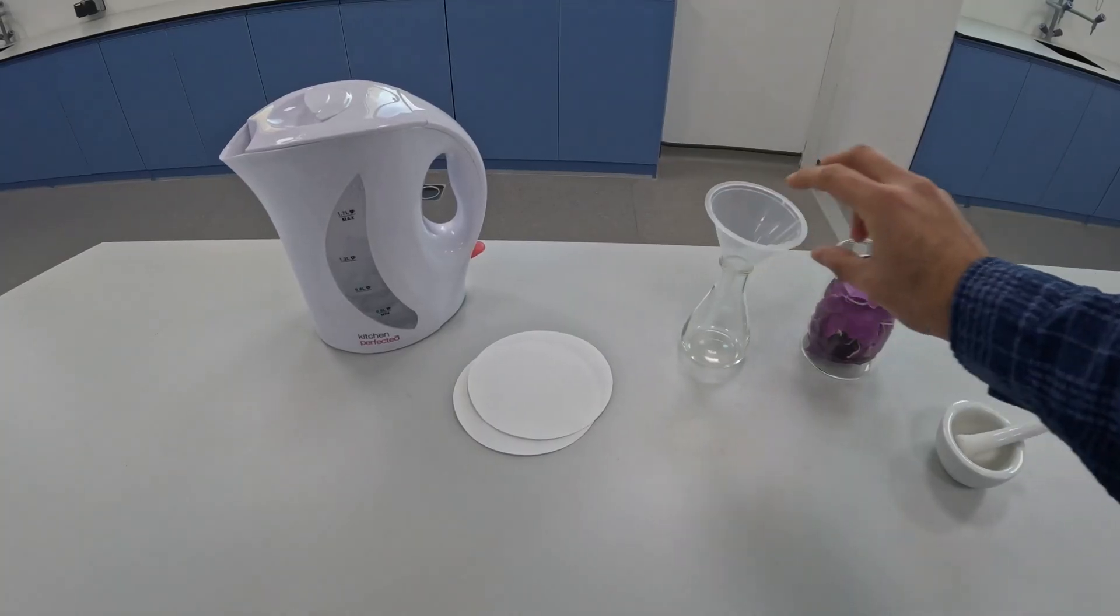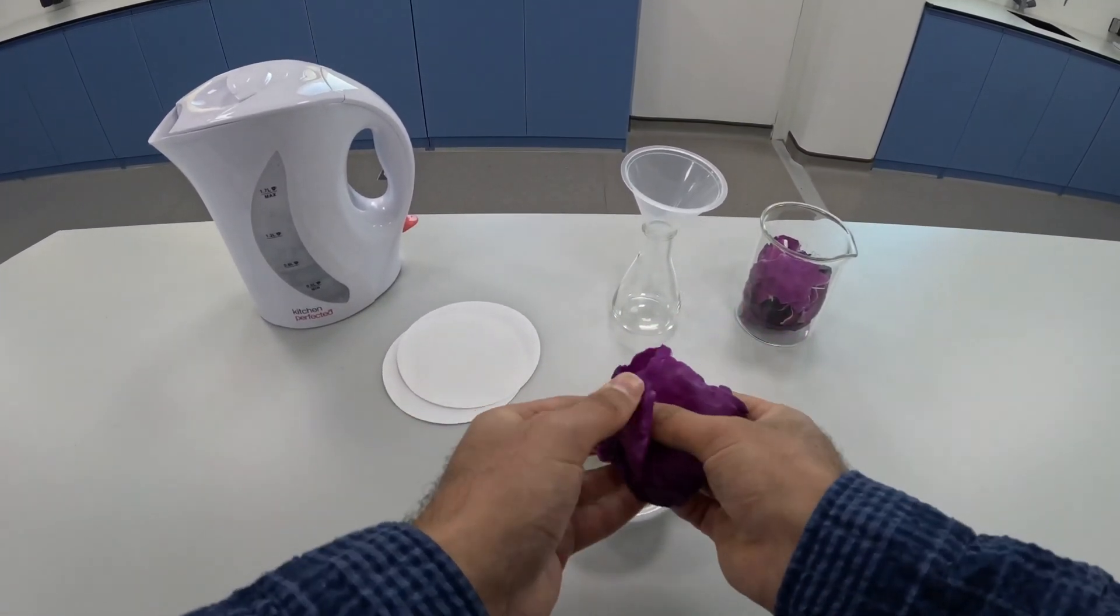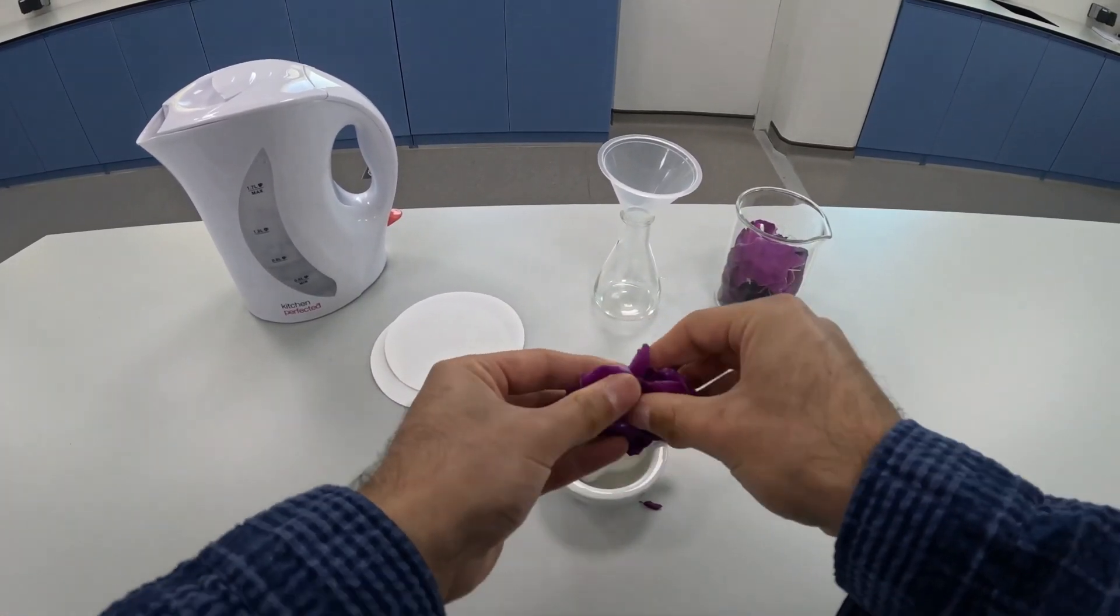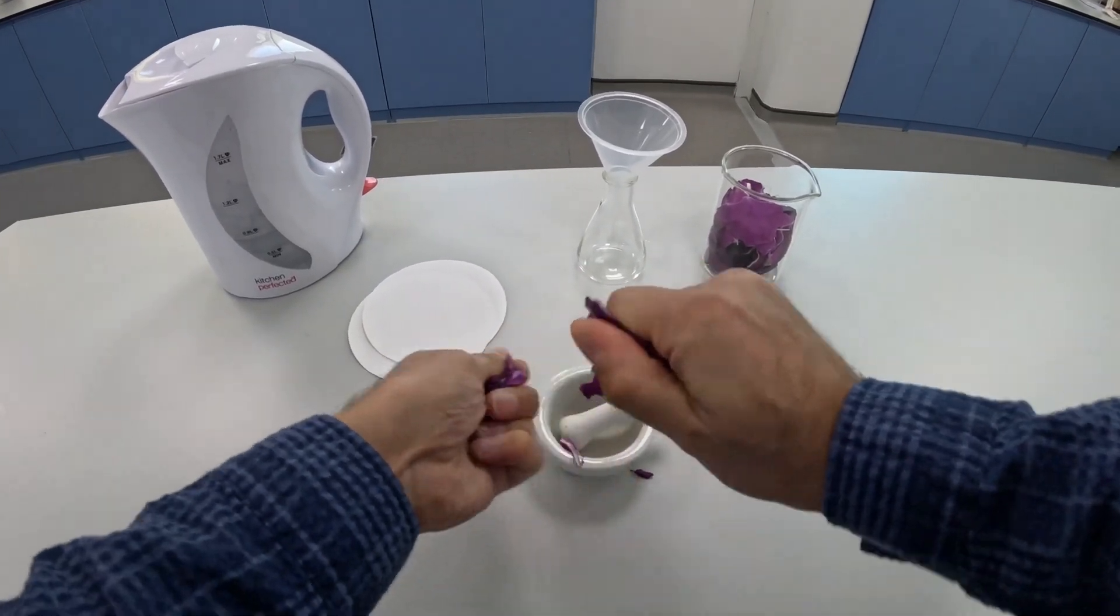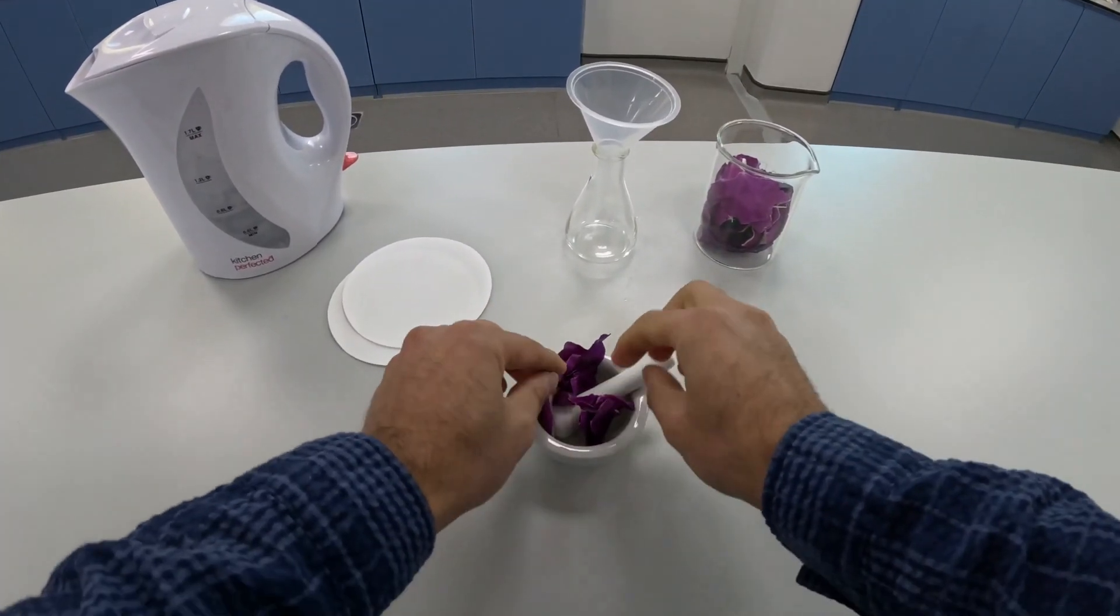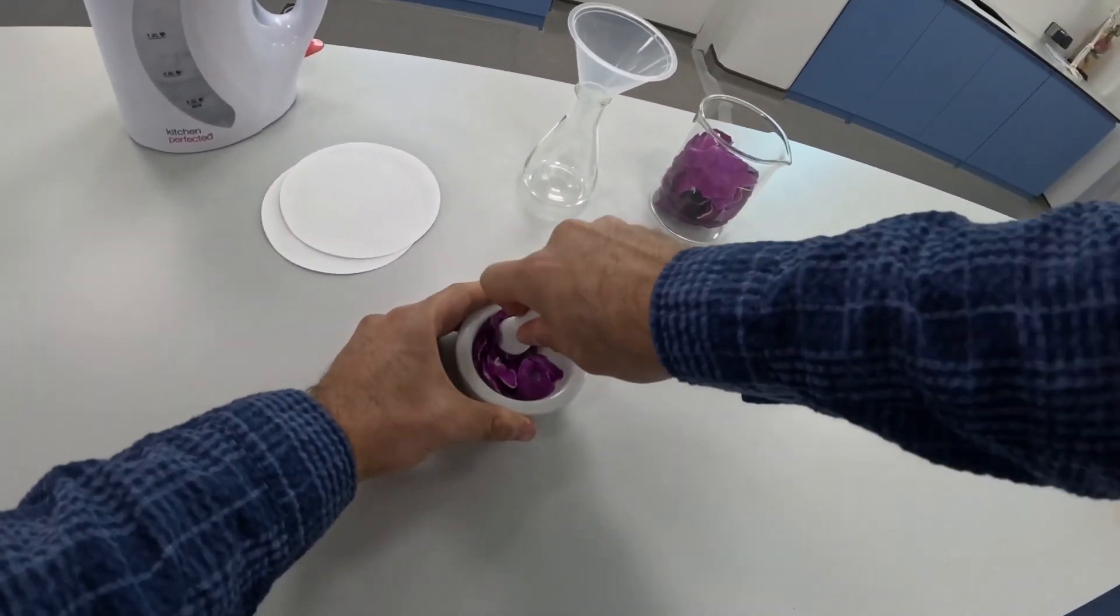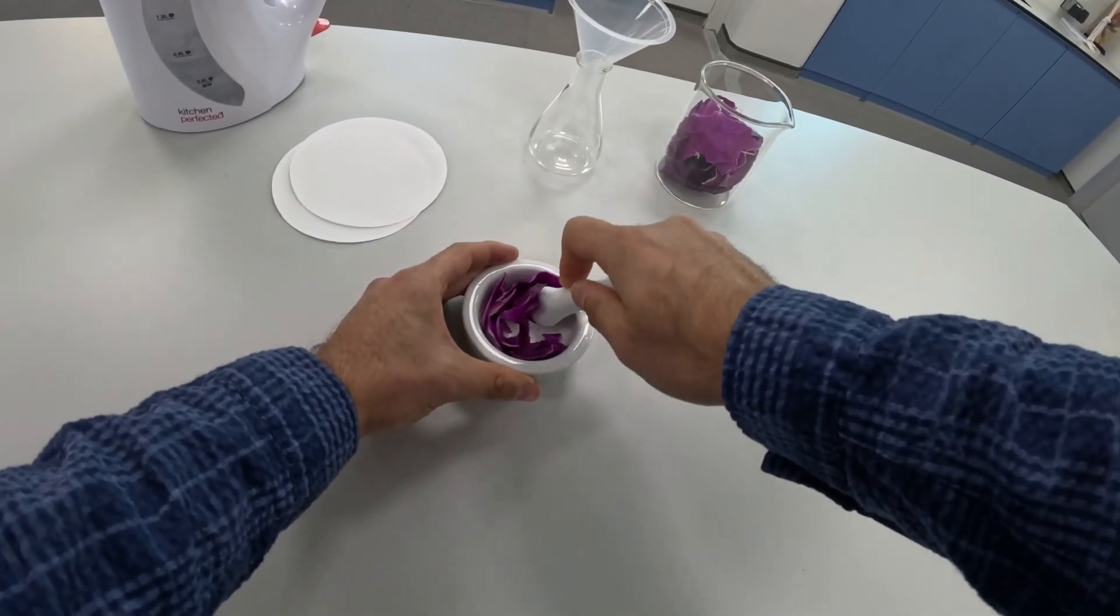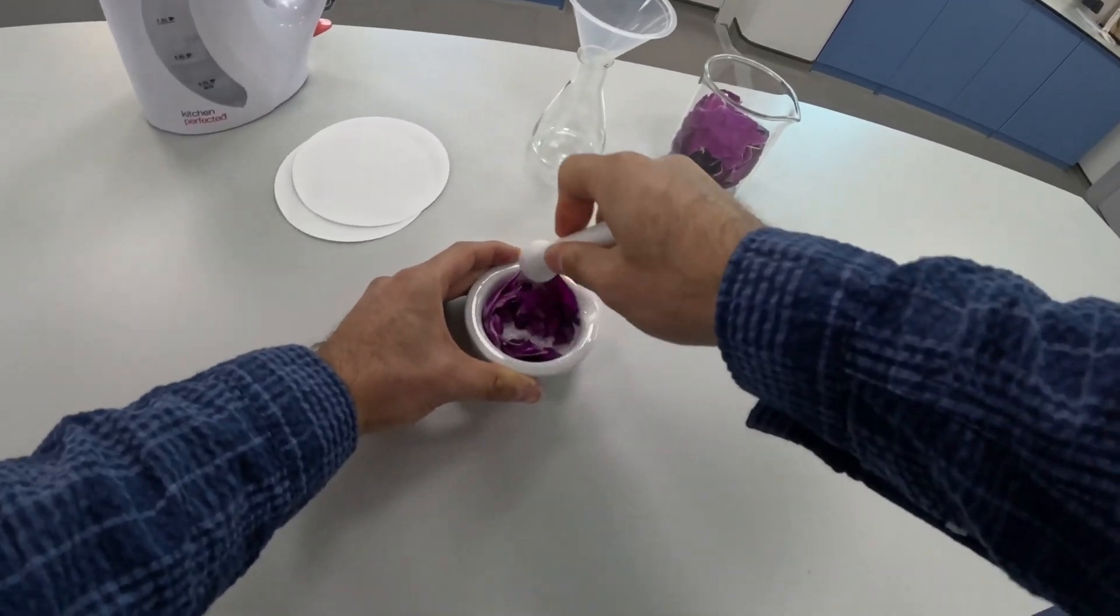So we're going to first start by putting some red cabbage in small pieces into our pestle and mortar and then we're going to crush it up as much as we can over about 10 minutes. You really want to crush this really well so all of the colorful pigments can come out of the cells of the red cabbage.